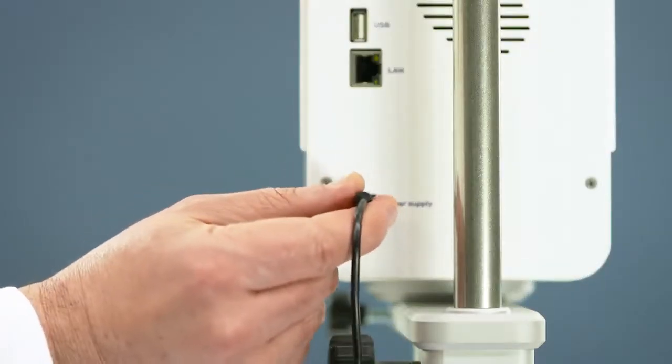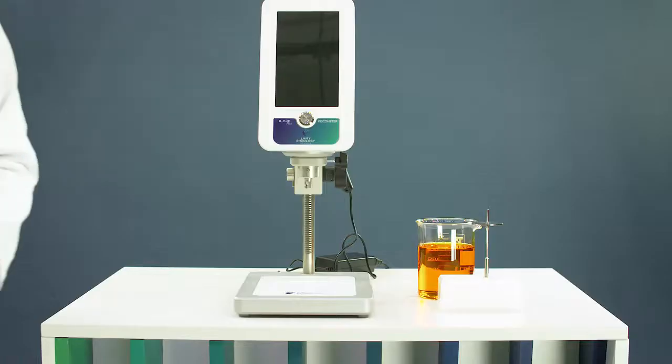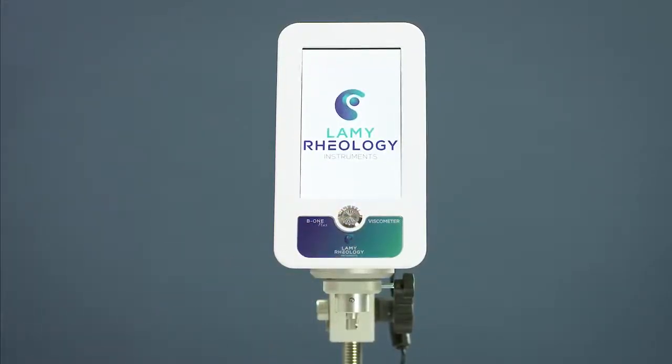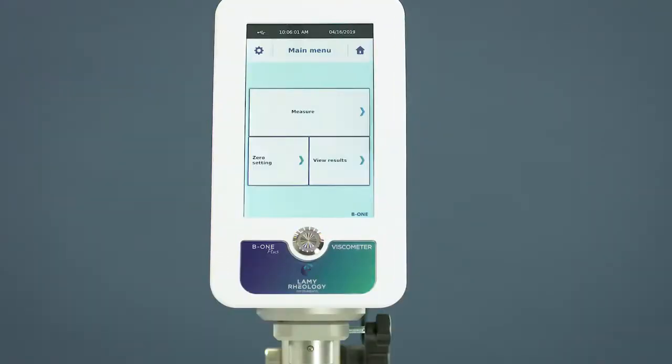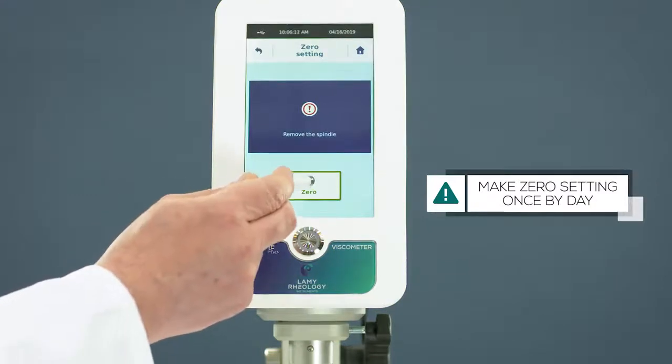Plug the power supply on the rear panel of the device. Switch on the B1 Plus. Zero the device. You should do this at least once per day.